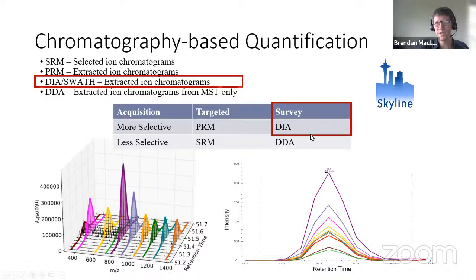But this is where you set the mass spectrometer up with some general parameters and you run it, and then you go analyze the data afterwards. So you don't have to make any choices, or don't have to make that many choices up front.